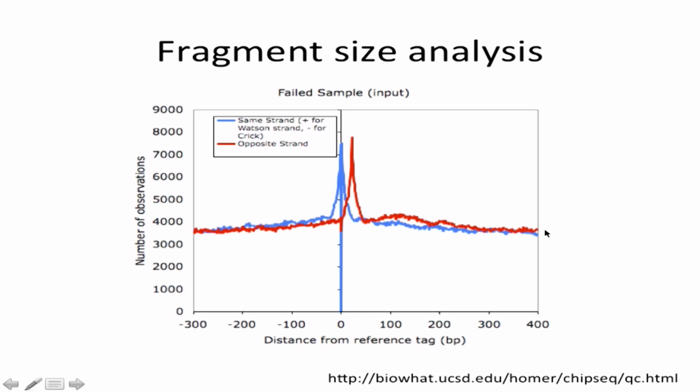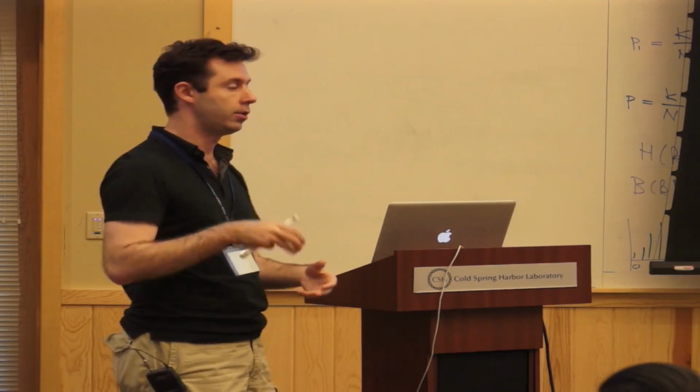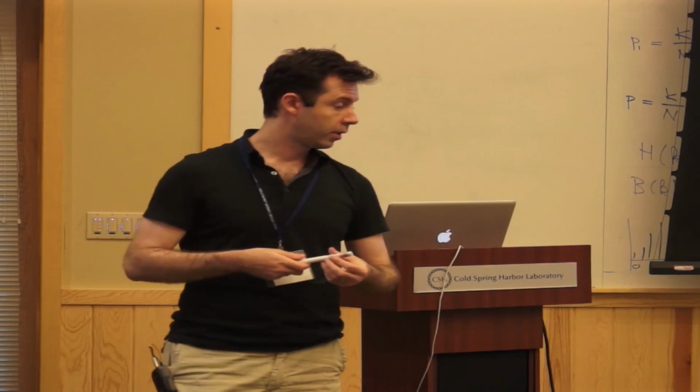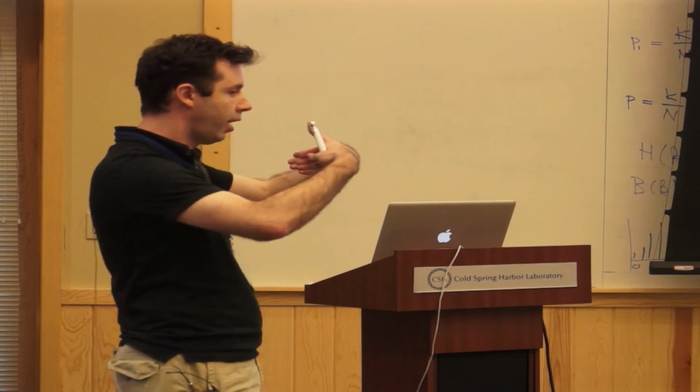The enrichment is not present in this. It's not a peaky data set, okay? So this is a nice way to determine genome-wide whether you have an experiment that worked and that gave you nice peaks that you can pursue in terms of analysis. So if it's a good experiment, you just see more separation. That's right. If it's good, you should have more separation.